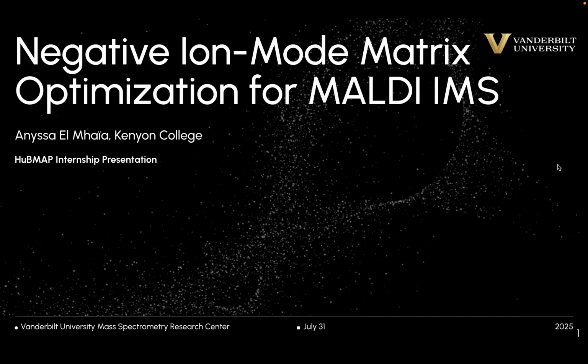Hello everybody, my name is Anyssa Mhaia, and this summer I had the wonderful opportunity of working with Vanderbilt University's Mass Spectrometry Research Center, where we focus on optimizing matrices for negative ion mode MALDI-IMS.